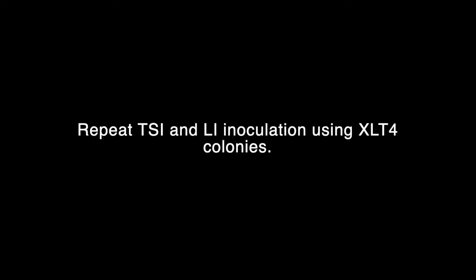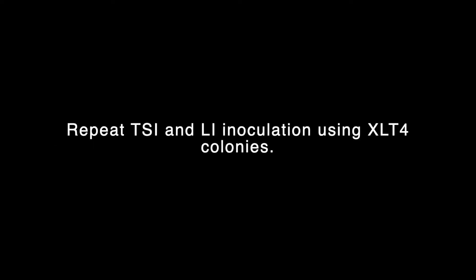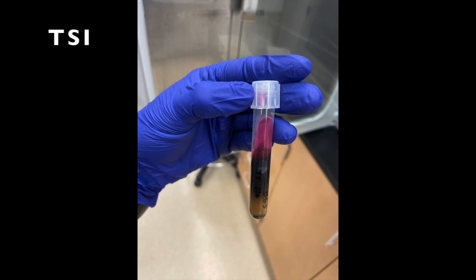Then repeat your TSI and LI inoculation using XLT4 colonies. Incubate your TSI tube at 37 degrees Celsius for 24 hours. Incubate your LI tube at 37 degrees Celsius for 48 hours. This is one of the inoculated TSI slants.